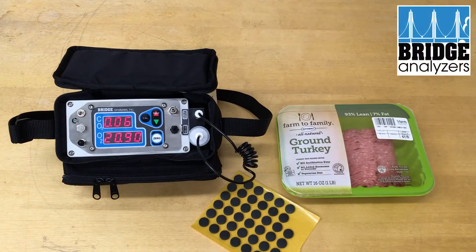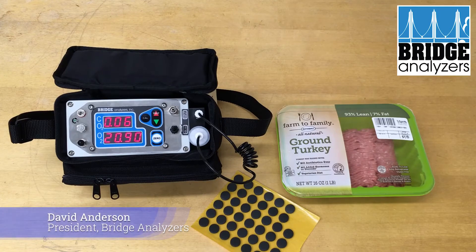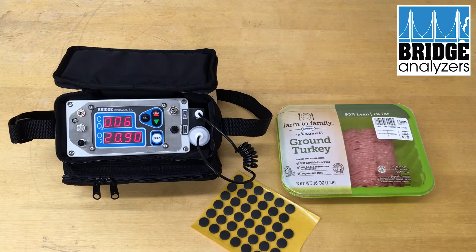In this video, we're going to show a basic, simple, single test using our MAP analyzer, which measures CO2 and oxygen. This is a two-gas MAP analyzer.